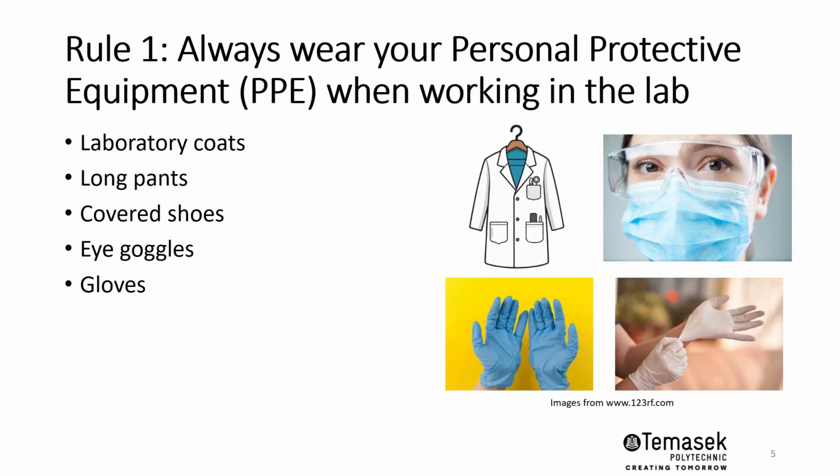I'm outlining some of the rules here. The first rule is to always wear your PPE, your personal protective equipment, while working in the lab. This includes your laboratory coat. Wearing long pants also helps to prevent any spillages from coming in contact with the skin on your thighs. Wearing covered shoes is important, just to protect your toes if something were to land on them, as well as to protect from any contact, be it a liquid or solid, coming into contact with your legs or toes.